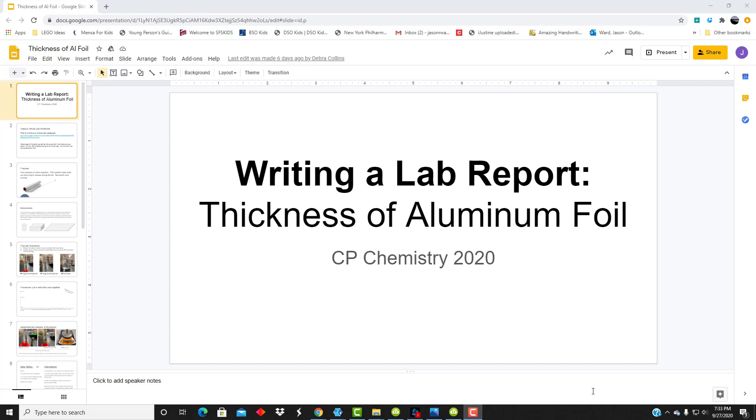And then the next time, you'll be expected to repeat these steps that we're going to be going over, and you can always refer back to this video. There are also tutorials within the lab notebook itself for different elements that you might need to incorporate.